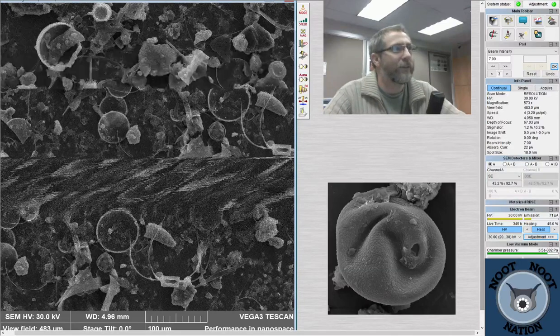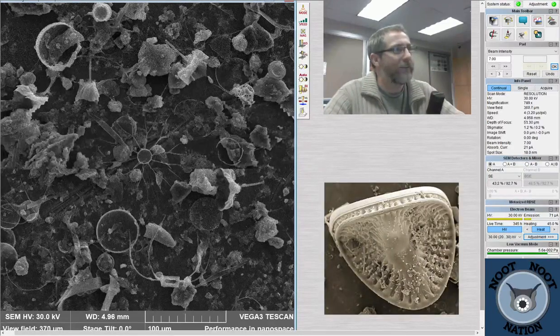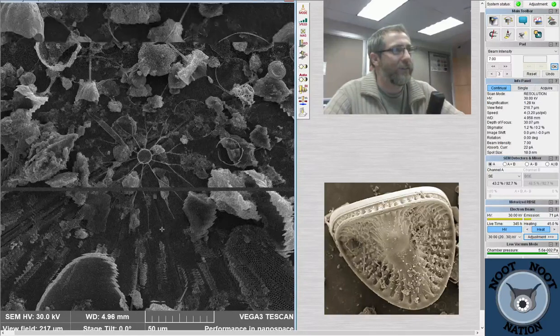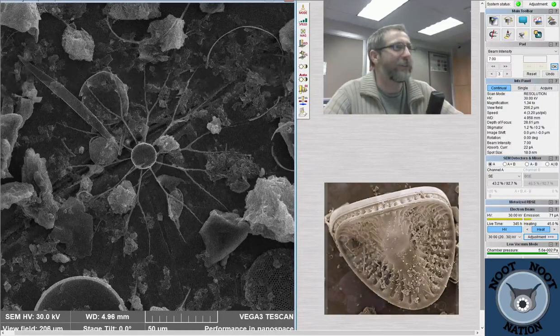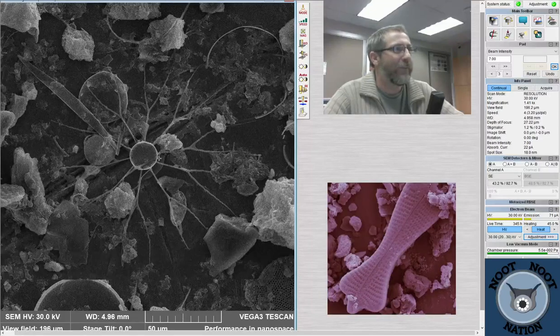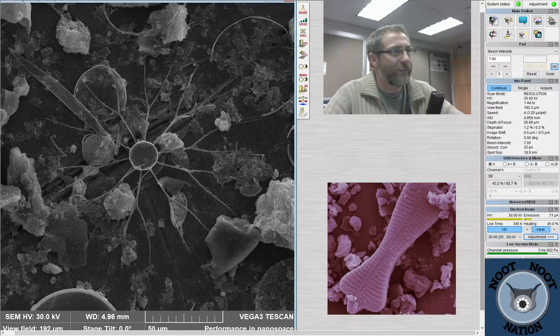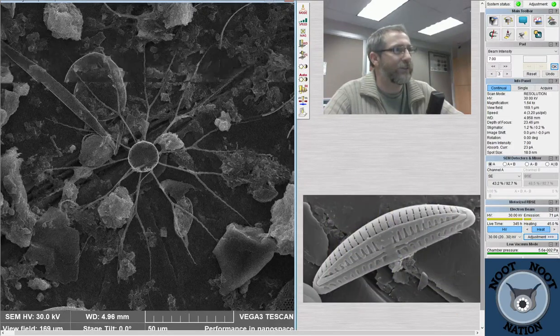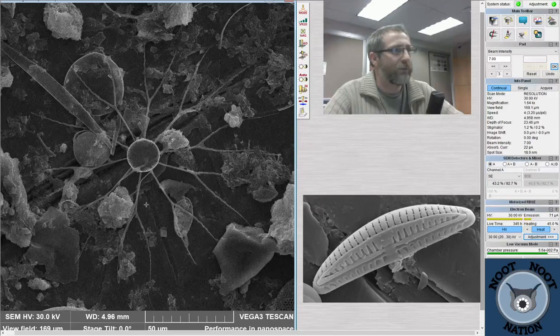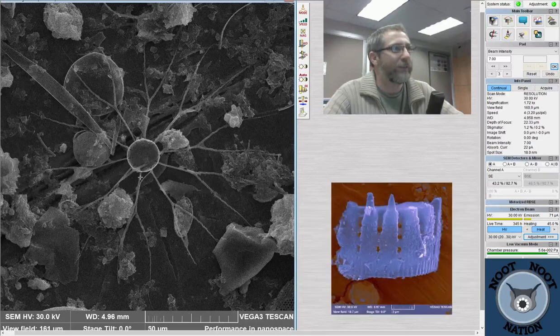I'm very excited about this one, and hopefully Pacific Plankton is still here. There's a diatom here that looks like a sun combined with a tree. A really cool looking diatom. It creates these really long, I think maybe they're also setae-like structures. I think they're long tubes, and I think there's silica. So it looks like a brain cell or something. Kind of cool looking diatom.